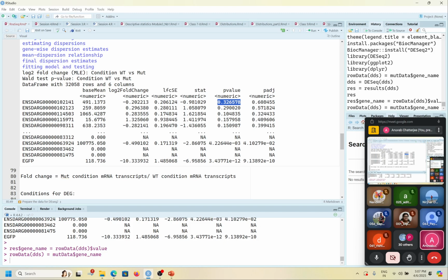So we only care about this, and it is very easy for us to just look at it, but I am not going into that part because it is very complicated. We just care about this. DESeq2 does it very easily for us.